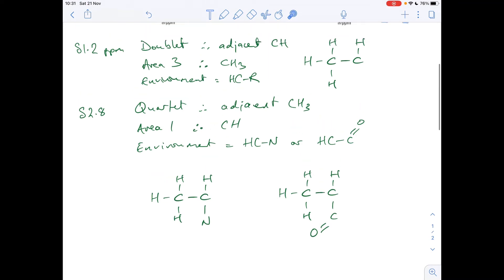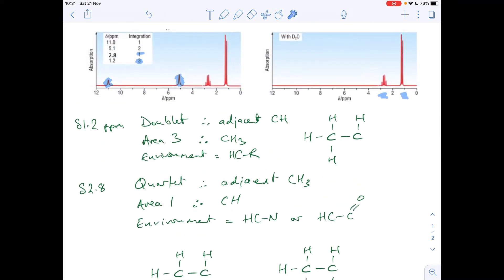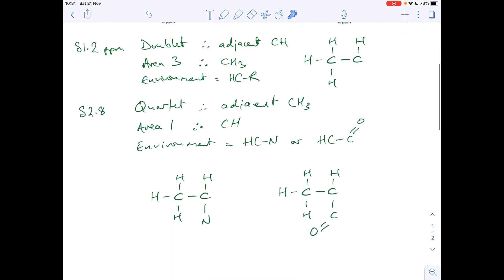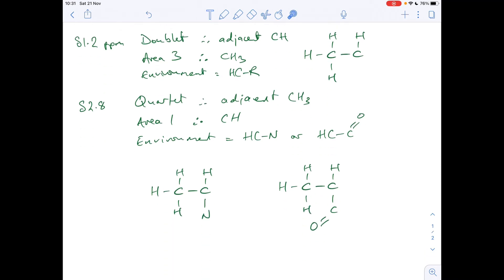So we'll just go to the peaks that have disappeared now. So we'll go with this one first, the 5.1. So we've got an area of 2, an integration value of 2. So what that means is there are two protons in this environment. Now we know there's a nitrogen in the molecule. And the obvious or the logical thing to do is to say this group here, that could be an NH2 group, which is consistent with what we've already said. So you'll notice I've added the molecular formula now of the compound.